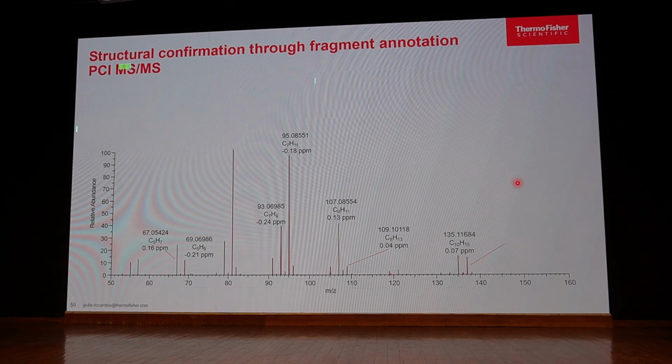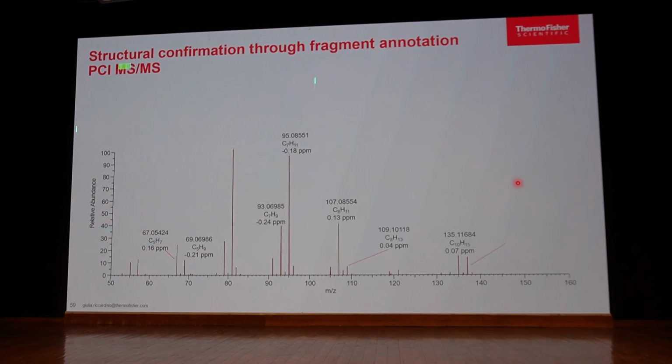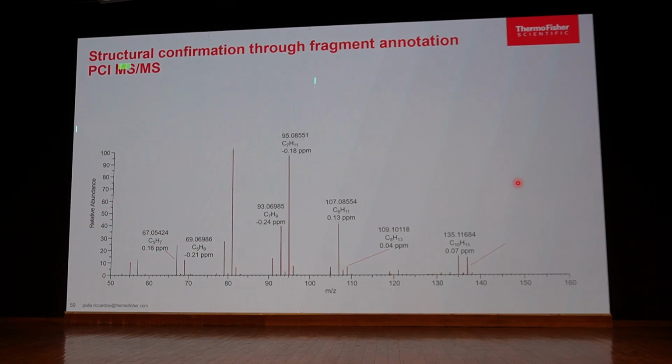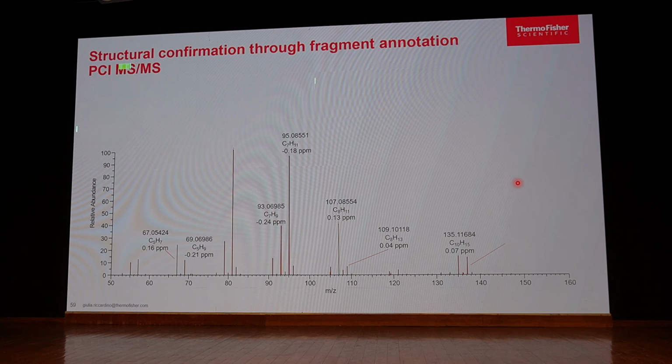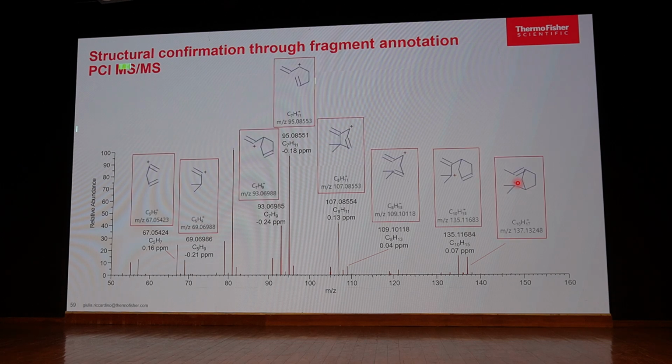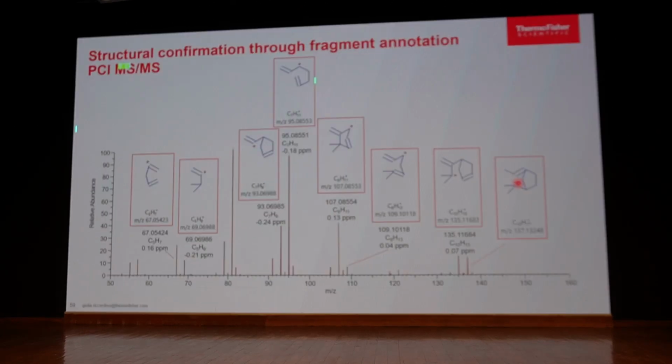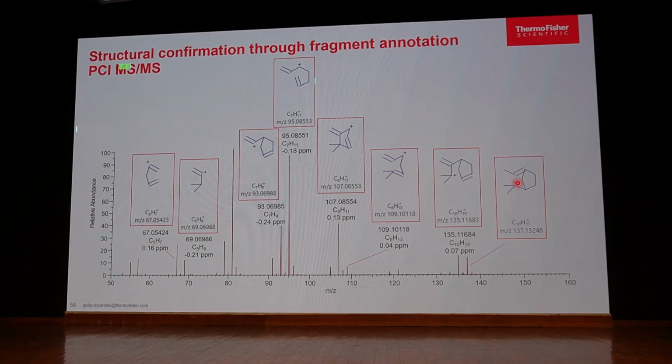That is the beauty of the Orbitrap. With any HRMS you can see MS/MS spectra, but you cannot give the guarantee about your mass accuracy. But here you can see that your fragment ion mass accuracy is also passing within a 5 ppm mass error. So that is a very important aspect. And parallelly, because of the fragment coverage, you can see that your structural fragmentation pattern matches with the observed fragment ions. So you can have the complete information. Any organic chemist or synthetic chemist can sit down and interpret very well to write down all the information.